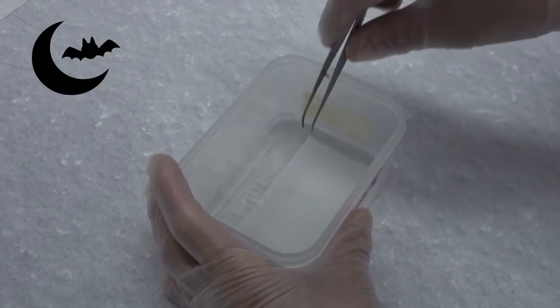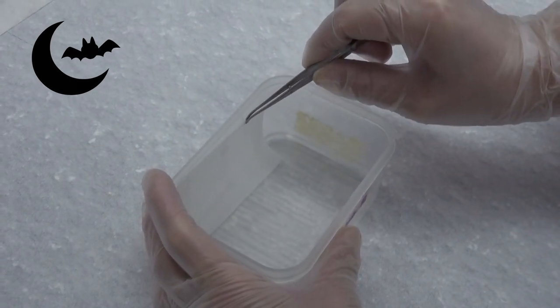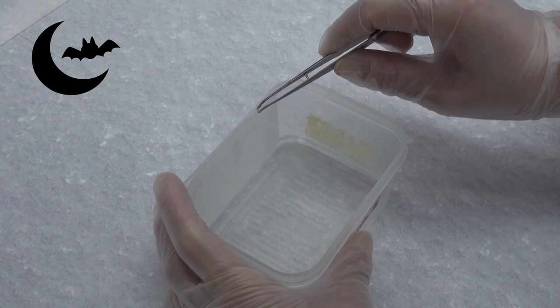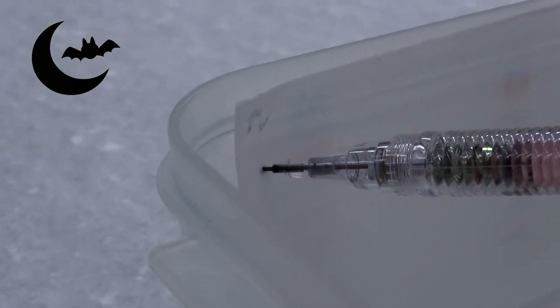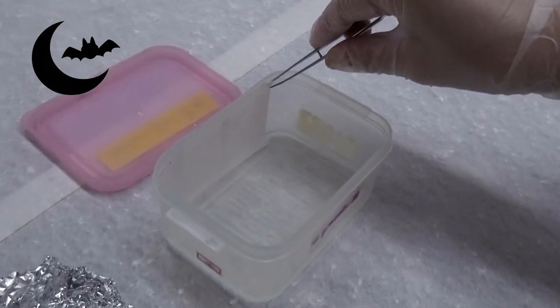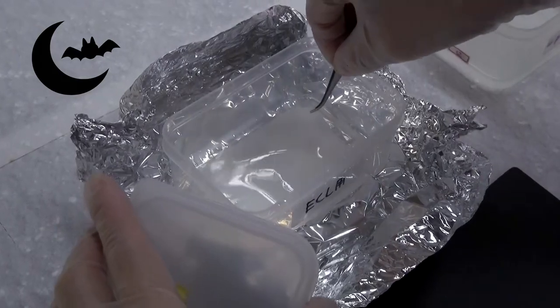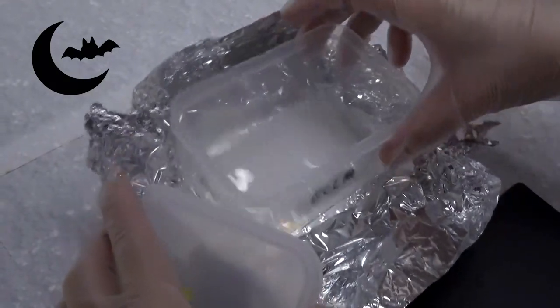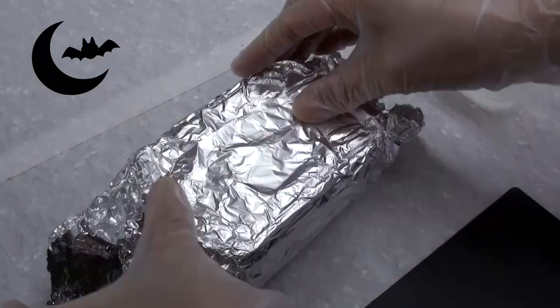Pick up the membrane by tweezers and slightly drip off the PBS solution. Hold the membrane so that the side with the group ID or number label faces upward and the cut corner is at the lower left. Use a pencil to draw a dot or mark next to the pink molecular weight marker; this mark can help to determine the molecular weight of the target protein later. Open the lid of the ECL box and place the membrane in the box. The reaction solution must cover the entire membrane. Alternatively, use a plastic pipette to take the mixed ECL solution and directly drop it on the membrane. Incubate in the dark for 1 minute — please watch the time.